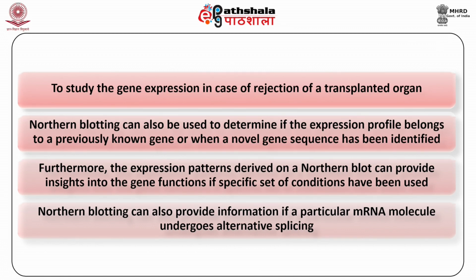Northern blotting can also be used to determine if the expression profile belongs to a previously known gene or when a novel gene sequence has been identified. Furthermore, the expression patterns derived on a northern blot can provide insights into the gene functions if a specific set of conditions have been used.